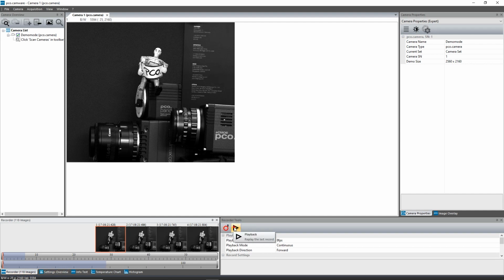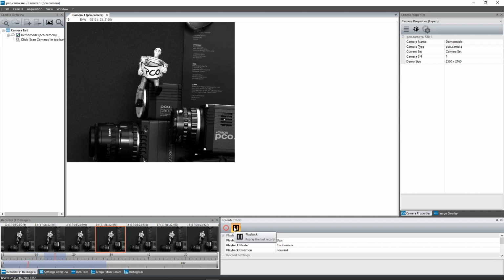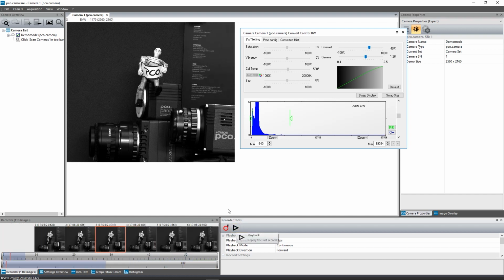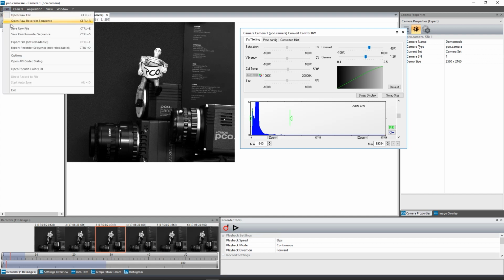You have now access to the raw data of your experiment, which you can analyze or adjust based upon your preferences. If you export an image or video file, they will be sensitive to the contrast or color adjustments you have selected. Be aware the adjustments will not affect the raw data. Therefore, it is always recommended to keep your raw data as a 16-bit file additional to the exported images.